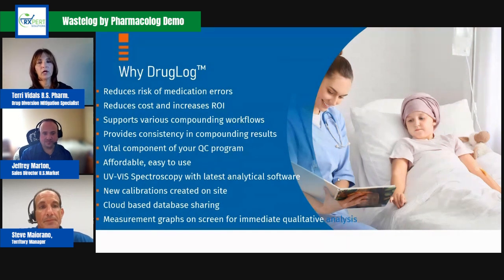Now, I know in at least some states, California being the one I'm most familiar with, you are required to sample for quality control. And everywhere I've worked, it's usually a send out because the lab just isn't set up to do it, and these types of products were not available. Would DrugLog meet that requirement? I don't know if there's a specific technology requirement for who you use.